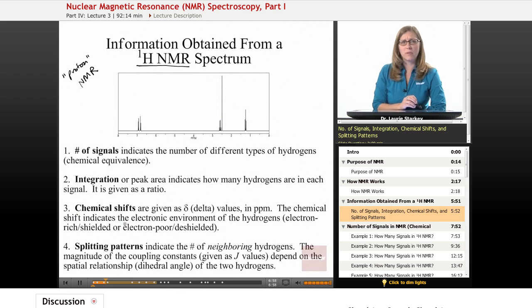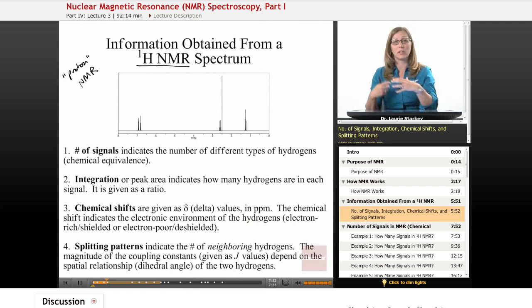The next thing that we'll look at is the chemical shift, and that's asking the question, where on this range is the peak occurring? So you see our numbers here are kind of zero to ten or so, and the location on this spectrum tells us a lot about the structure as well. These are called delta values. They're given in parts per million, and the location tells us something about the electronic environment of it. Is it a very electron-rich environment, electron-poor environment, and so on.